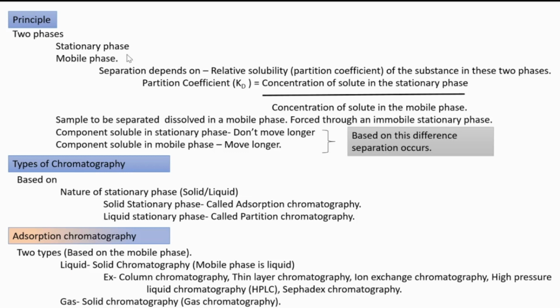Which are the phases? A stationary phase and a mobile phase. Means a stationary stage is there and also a mobile stage. Two parts are present in that procedure.